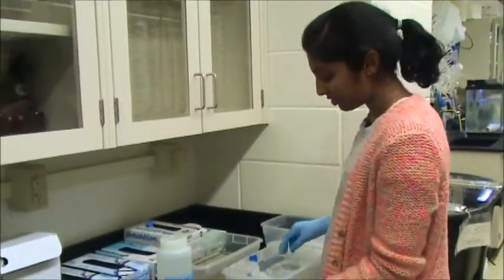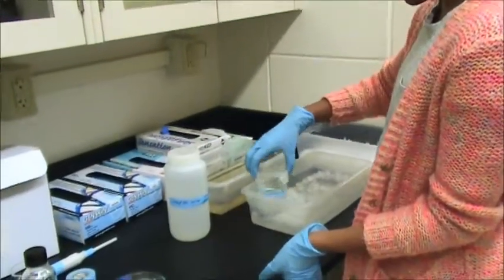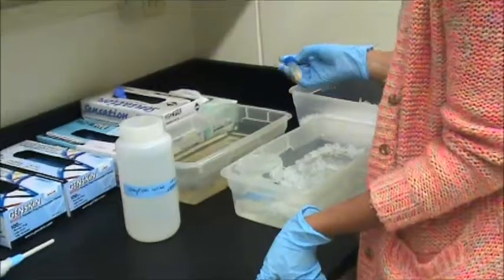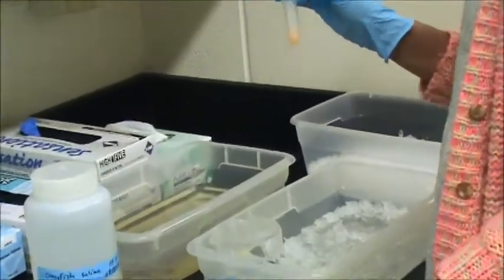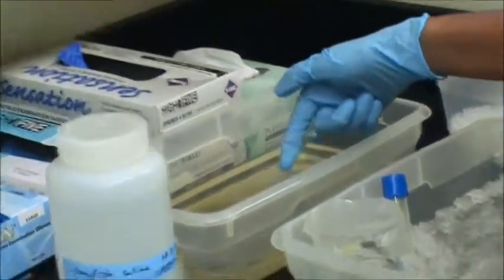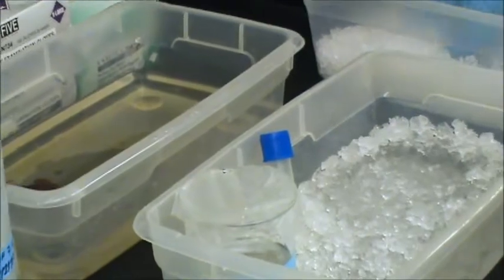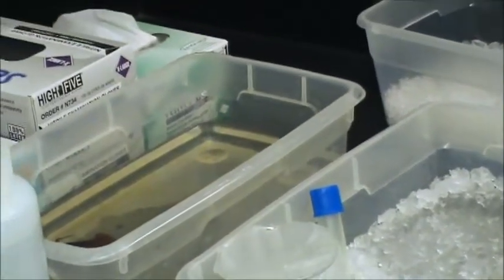Okay, so to start off this lab, we're going to have some crayfish saline, and we're going to want to put that on ice to keep it cool. And this is ground up muscle that we're going to use to make the muscle juice later. So we're going to take this crayfish in here, and we're going to put him in this ice, and we're going to put more ice on him to anesthetize him.